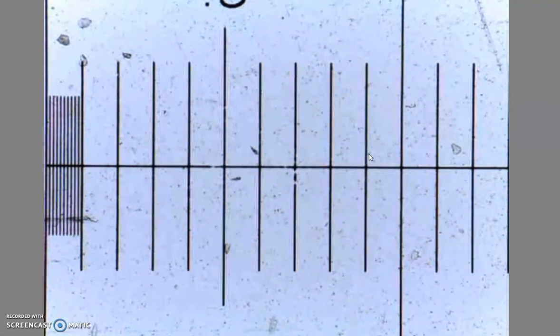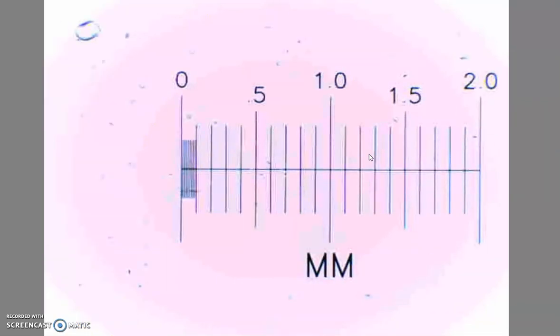So the field of view diameter will just be the length here, and then you're going to also look at it in micrometers. So again, remember, let's zoom all the way out, that this is in millimeters. You also are going to be using some things in micrometers this semester, which is notated by the weird looking U that is listed in your lab book, and you have it in table 2.1 on page 19. In order to convert from millimeters to micrometers, it's a factor of 1,000. So all you have to do is multiply by 1,000.